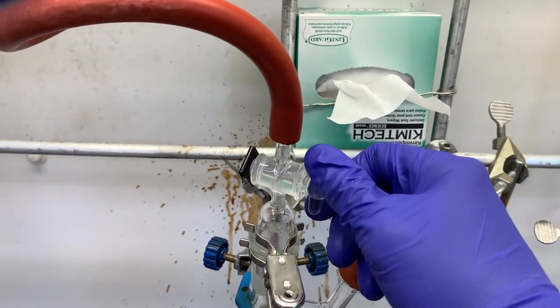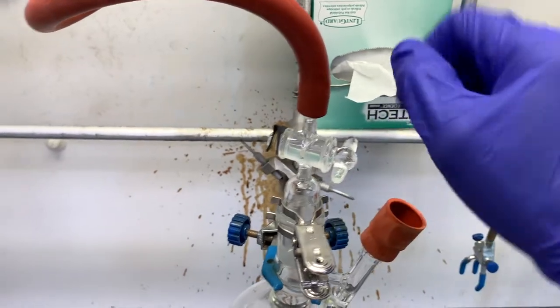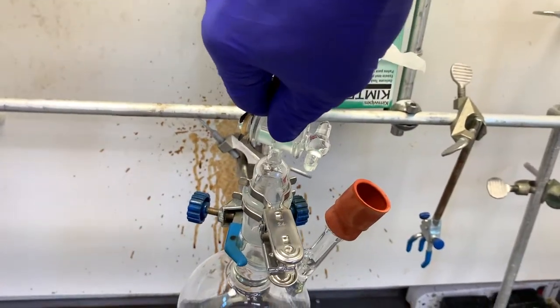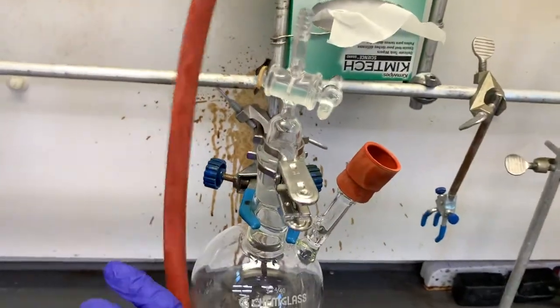Once your rubber septum is secured, close the flask at the hose barb adapter, close the tap on the Schlenk manifold, remove the hose from the flask, and stash the flask in a chemical carrier and bring it over to the solvent still room.